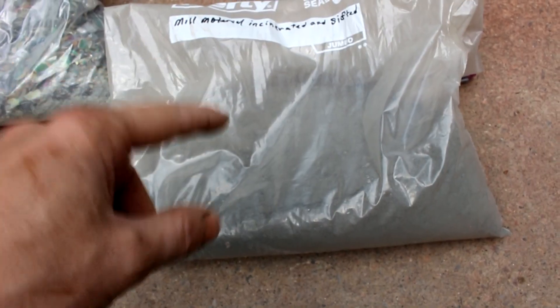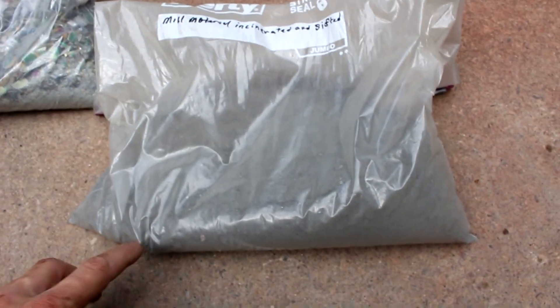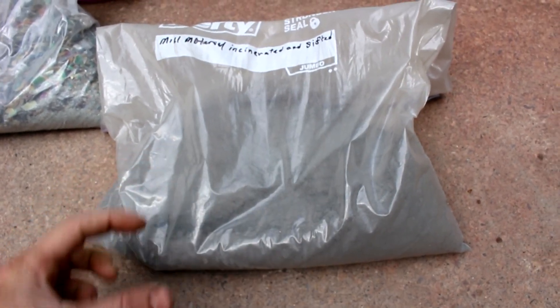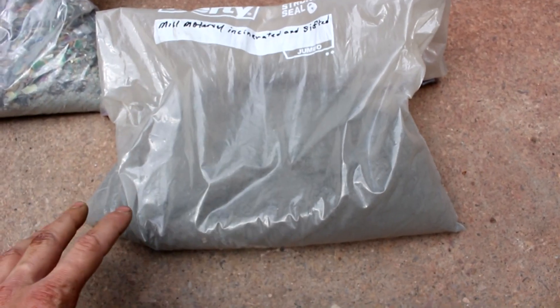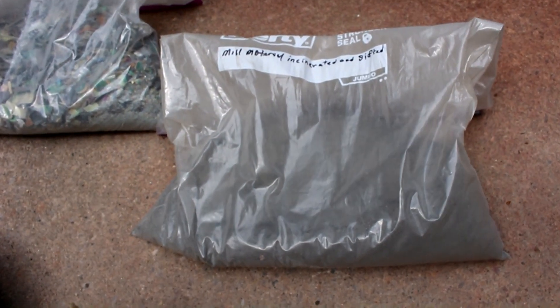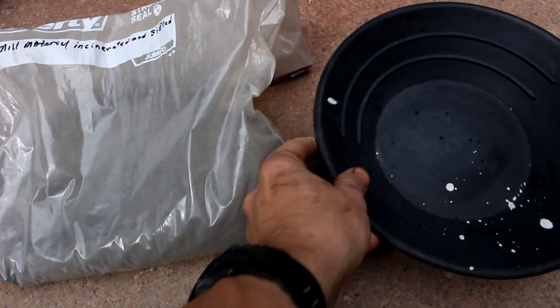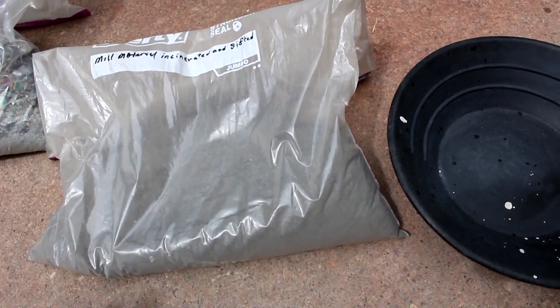I've already done a fire assay on this, about four or five months ago, and I found about five milligrams of gold in a 150-gram sample, which means there's less than an ounce per ton of gold in this. That means if you're going to try to make money on this, the margins will be incredibly tight but should still be possible. Let's see how much gold I can actually extract using some sort of actual process.